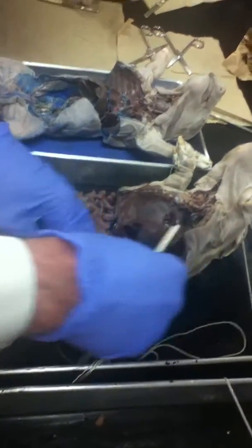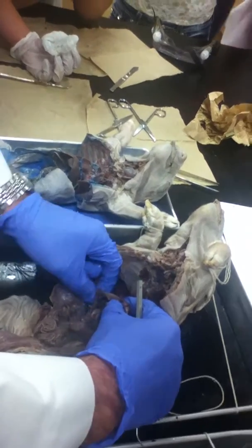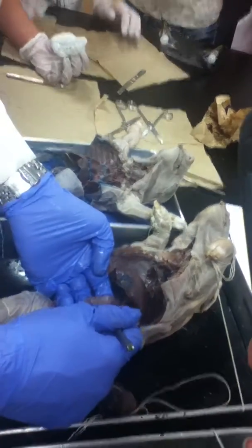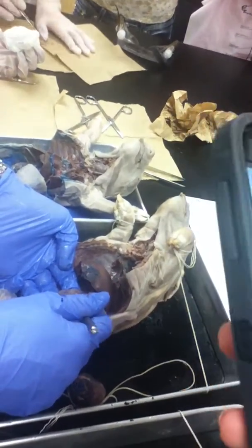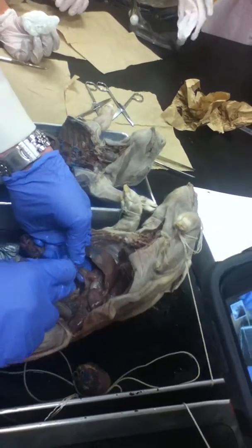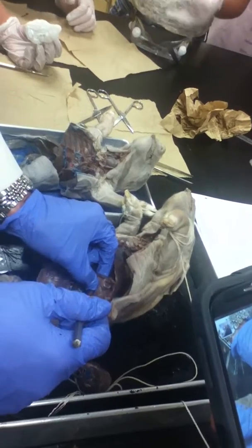The duodenum is the first part of the small intestine. So you look for the pyloric sphincter here, which is the connection point between the stomach and the first part of the small intestine. So this here, right after the pyloric sphincter, attaches to the stomach. That's the duodenum. Pancreatic duct, you're not going to see it, it's pretty hard to see. But the pancreatic duct would be in there, secreting into the duodenum. You could see right there there's this massive tissue. The pancreatic duct would be in there, along with the bile duct going in there. And this is your pyloric sphincter, as we said.